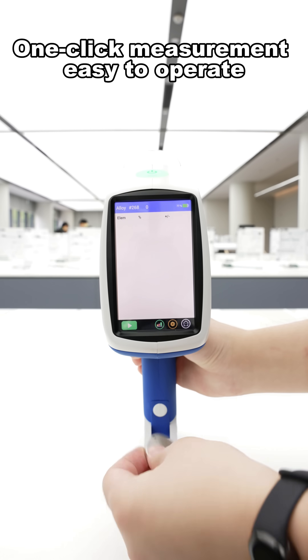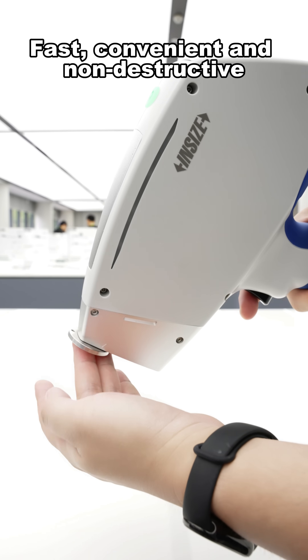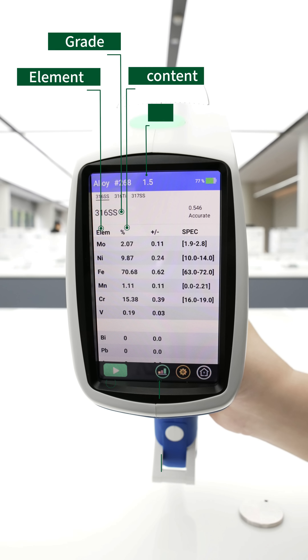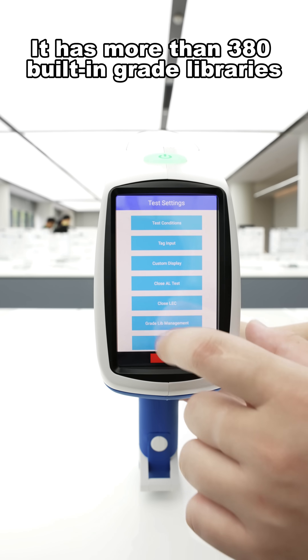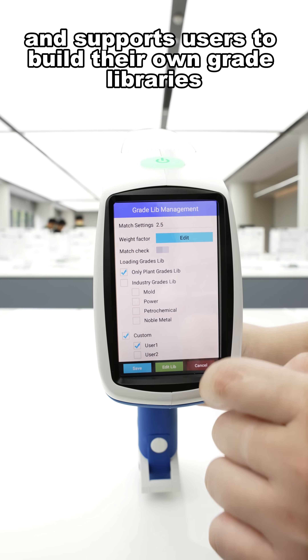One-click measurement, easy to operate, fast, convenient and non-destructive. Alloy identification takes only one to three seconds. It has more than 380 built-in grade libraries and supports users to build their own grade libraries.